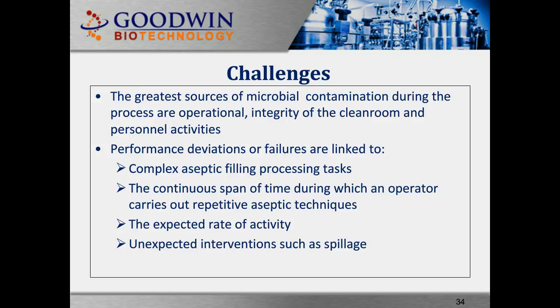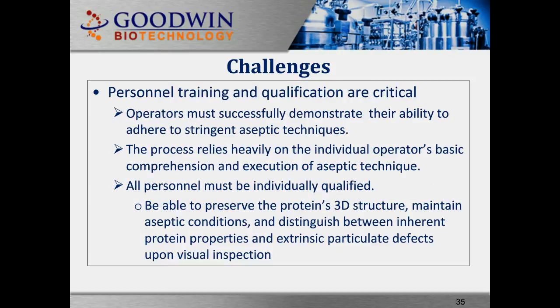Other challenges are that personnel training and qualifications are critical. It is very critical for the manual semi-automated fill process. Operators must successfully demonstrate their ability to adhere to stringent aseptic techniques. The process relies heavily on the individual operator's basic comprehension and execution of the aseptic technique.